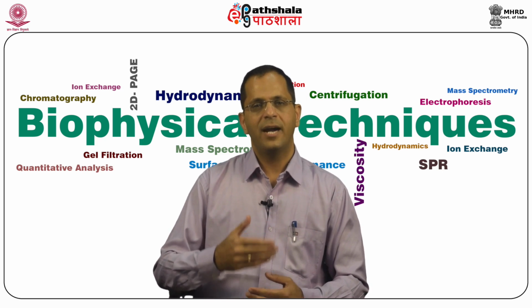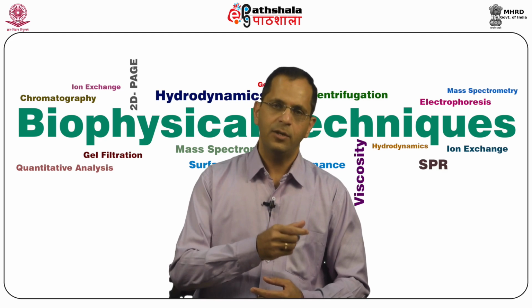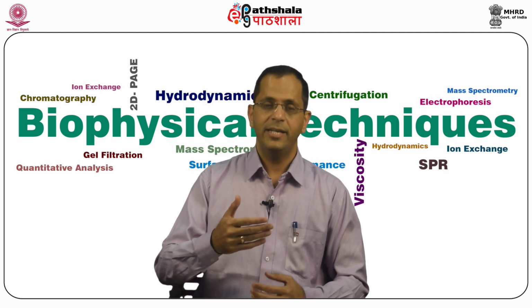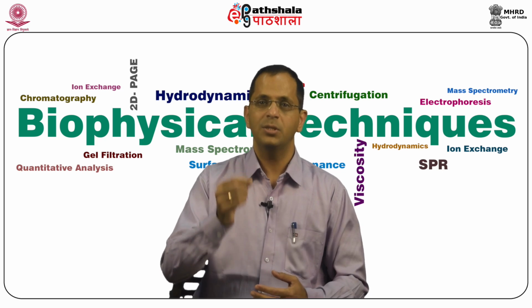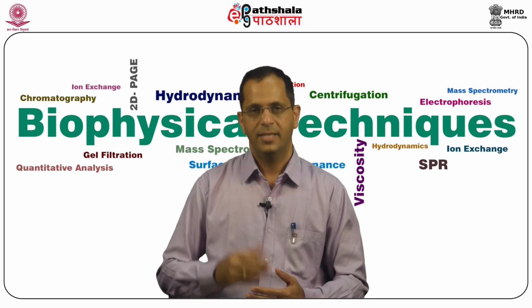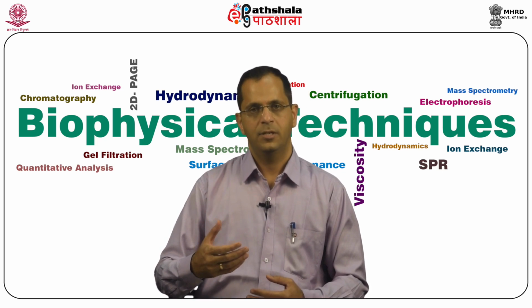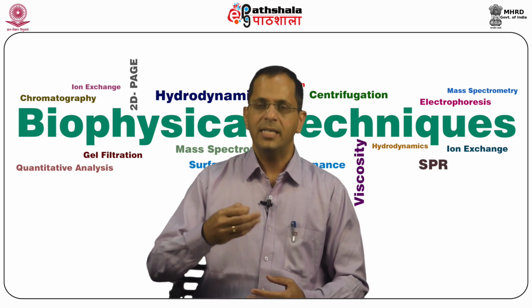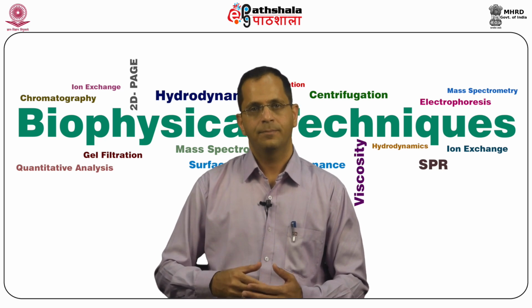Differentiation of variants of advanced ovarian cancer. Here, you need to differentiate primary ovarian cancer from metastatic ovarian cancer, and the advantage of both the patients presenting with ascitic fluid helps to use ascitic fluid as a potential source. Next, identification of biomarkers in leishmaniasis. So, you could be using serum that makes it very easy for the clinician to use at the OPD.